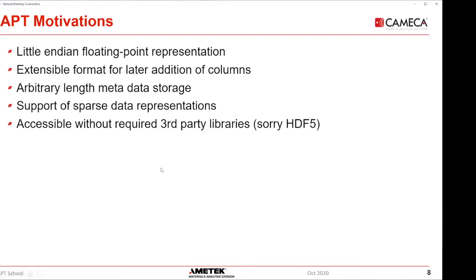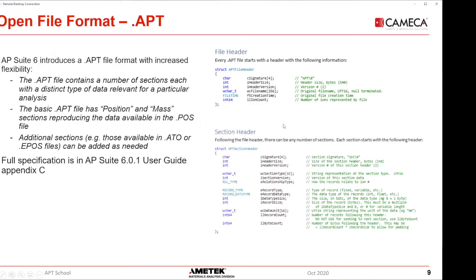So sorry, HDF5 again, but we will be supporting it in sort of an off-the-side import way. Anyway, a little bit more details about the APT file. The full spec is in our user guide, but I'll talk about it really quickly.